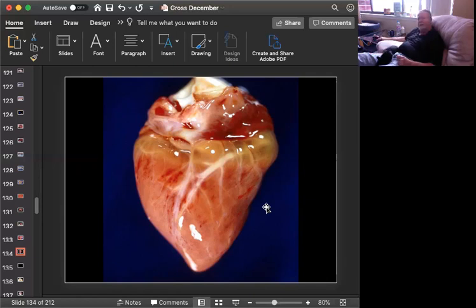One of the places that is very significant is around the coronary arteries of these goats. But anywhere that you used to have fat, in the mesentery, whatever, you will find this sort of watery yellow material. For my residents, I call this the melting goat syndrome, because you open the goat, it looks like it's melting inside. But it's just this tremendous serous atrophy of fat from malnutrition, starvation, age, and poor veterinary care. I'm not that interested in these hemorrhages on the surface of the heart. They're usually agonal. I don't know how this animal died, but it's a really nice slide of one component of the melting goat syndrome.